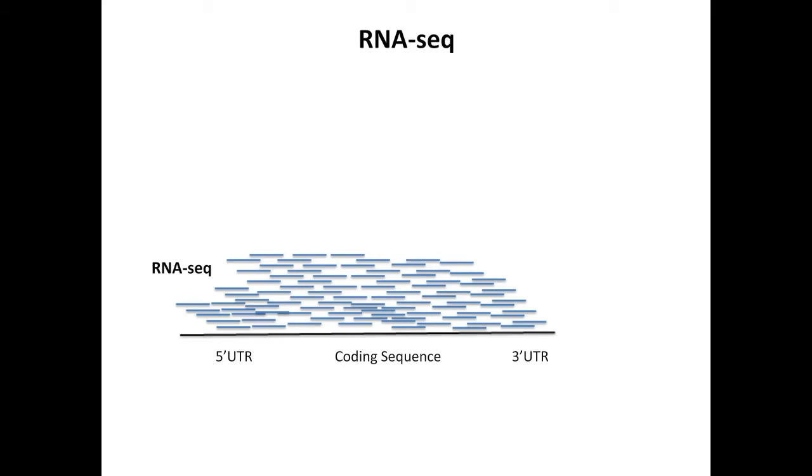So if you consider, for example, this figure shows the distribution of transcript length. It is in chicken, because my studies are mostly on chickens. So I took all genes from Galgal4, which is the version before the recent one.